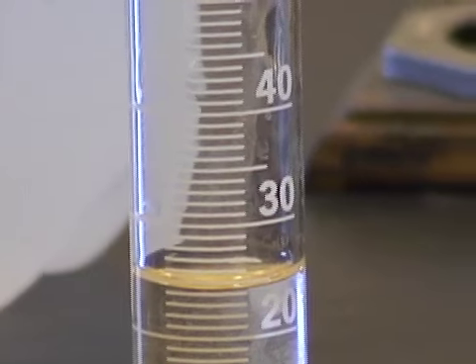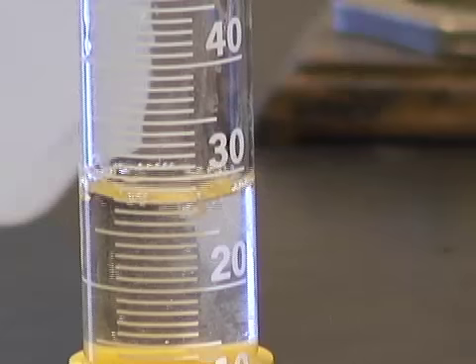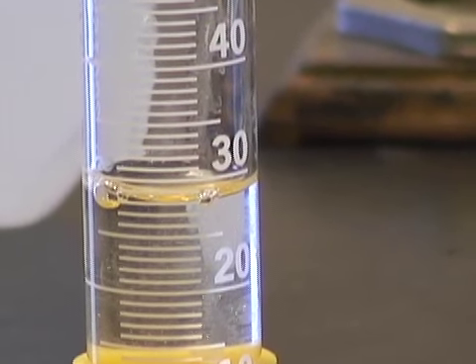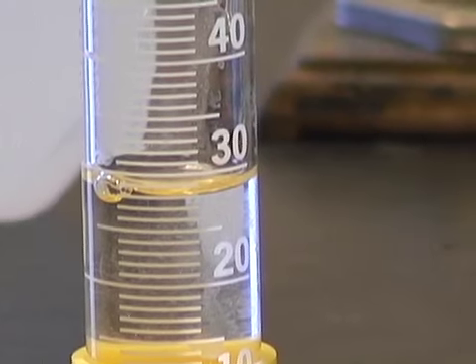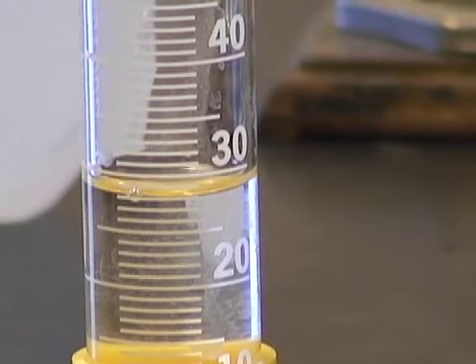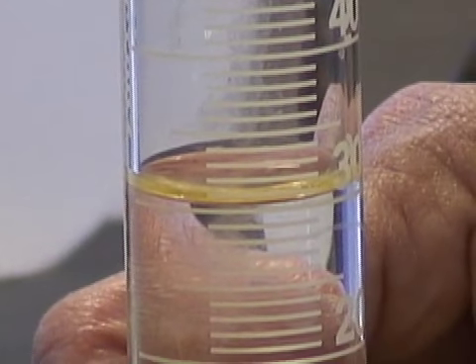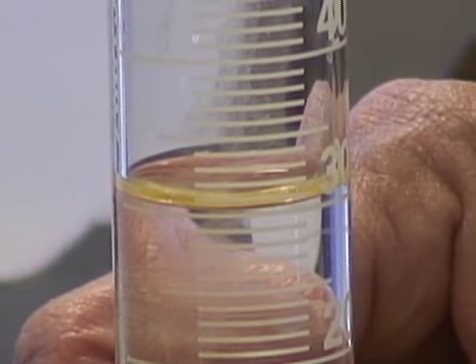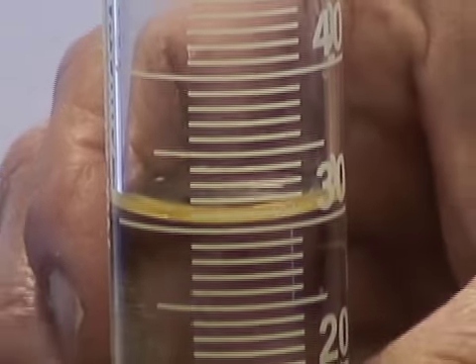I'm going to look at where the bottom of the meniscus is on the 30. Ooh, a little bit more. Now I have 30 milliliters in my graduated cylinder, and I'm going to add it to my solution.